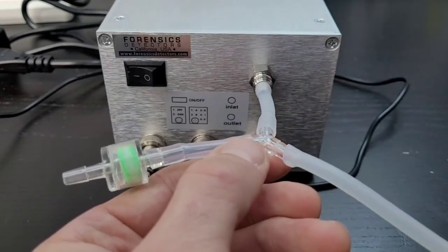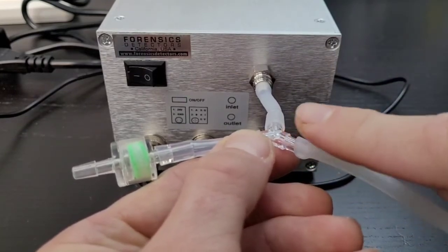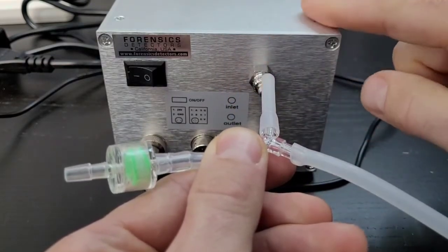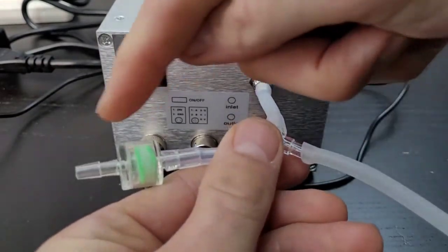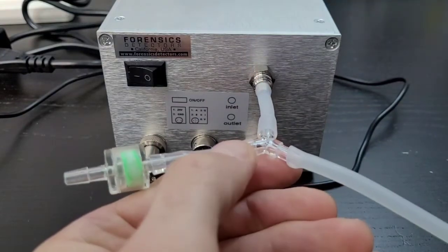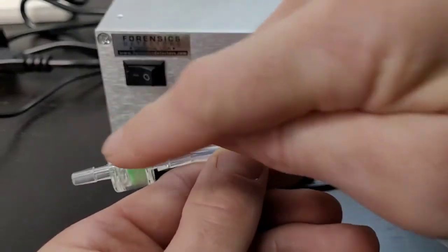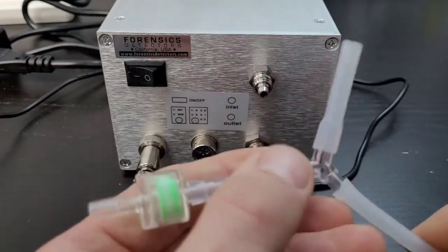It's a standard T-piece. It's good practice to do that. Again, if you are popping in some pressurized air coming from a pump or a process line or some other pressure point. Okay, that's the way it works. Okay, so we include this T-piece setup with the analyzer. Now, there could be a situation where you pop that on and for whatever reason, air is drawn this way. That's why we have the filter, so we can filter in the fresh air coming into the micro pump. Another reason why I like to put this is it gives it a small delta of back pressure, a very small amount, so that indeed we don't have any dilution effects as the micro pump is operating. Okay, and that's the way it works, folks. It's quite straightforward. If there's any questions, please let us know.